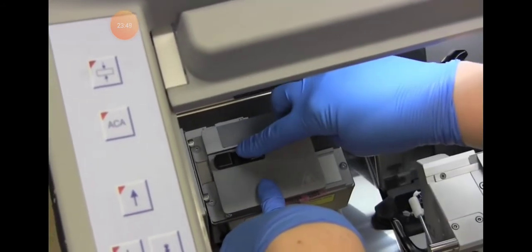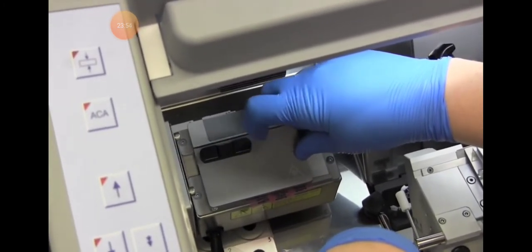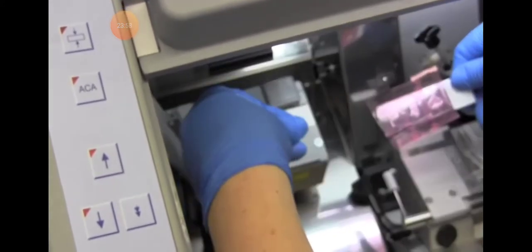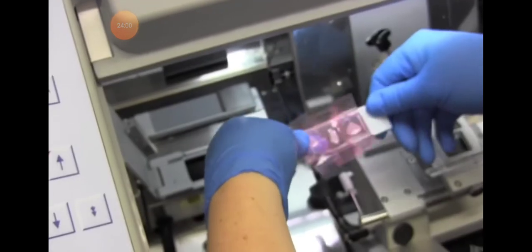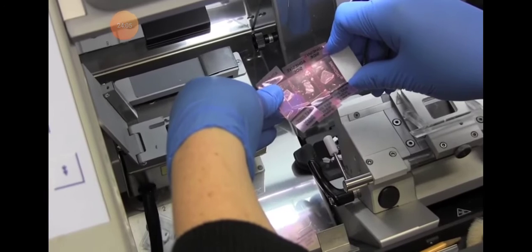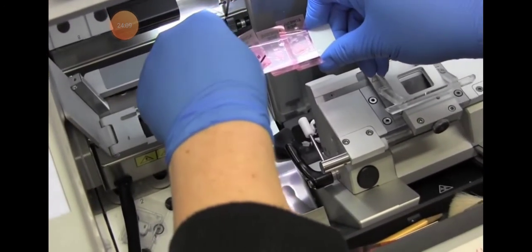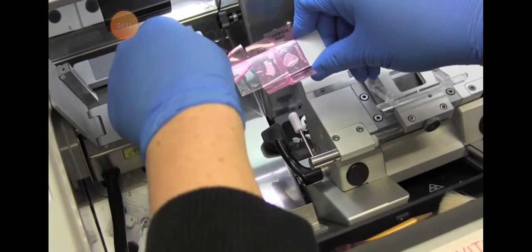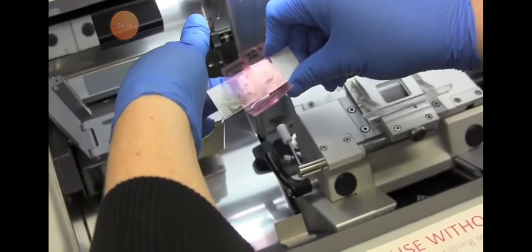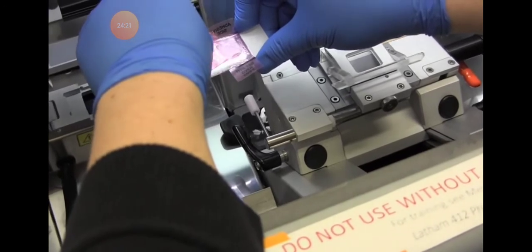Close the lid on the Cryo really quickly. It doesn't matter how long you hold it, but if you just snap it once and release, that shines a quick flash of UV light, and that allows the stickiness on this specialized slide to bind to the cryo matrix and the samples inside. I warm it with my finger really briefly. You don't want to get it too sticky. And hopefully what's left is your cross-section of a tomato stem.